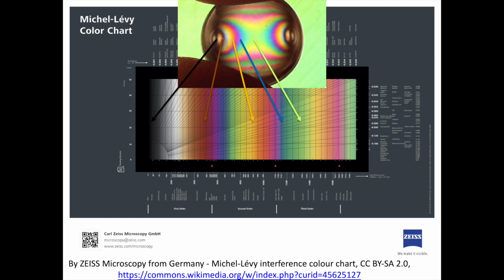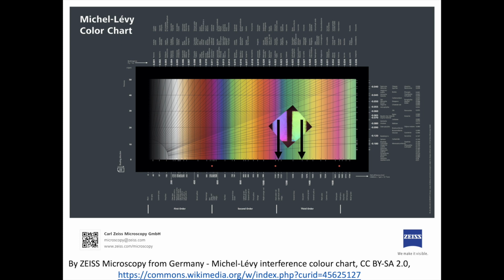We then work our way through the isochromes until we get to the middle of our BXA interference figure, which is the same color as our interference color. Now that we have an idea of where our interference colors lie on our Michel Levy Color Chart and the path differences that they represent, we're ready to understand how these two oriented muscovite plates interact with one another.